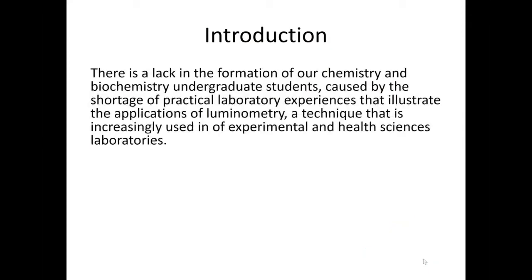Well, we have identified a problem. In spite of the increasing use of luminometry as a technique that is very widespread now in experimental and health science laboratories, our students could not get a good formation on this because there is a shortage of practical laboratory experience to illustrate this technique.